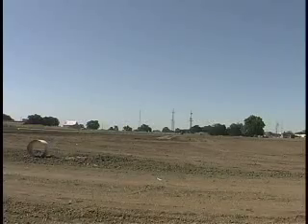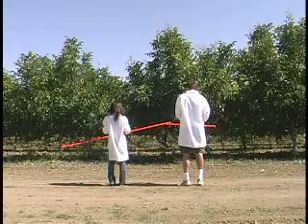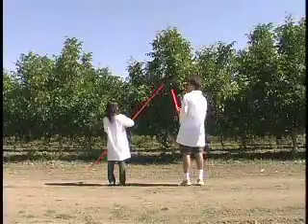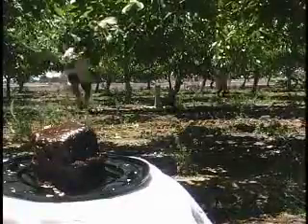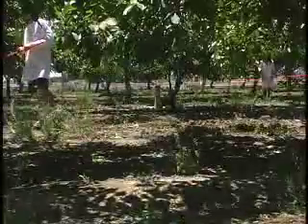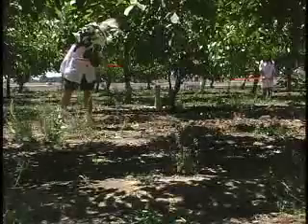Let's make an analogy. The polypeptides running through the polyacrylamide gel matrix are very much like people running through a forest with big sticks. Man, my protein's kind of small. Yeah, it is. The larger the stick, the harder it is to run through the forest. With a simple attractive force, the race begins. It looks like Nelson wins because he has a smaller stick. Very much like what happens in the gel. The smaller the polypeptide, the faster it can run through all of the obstacles.